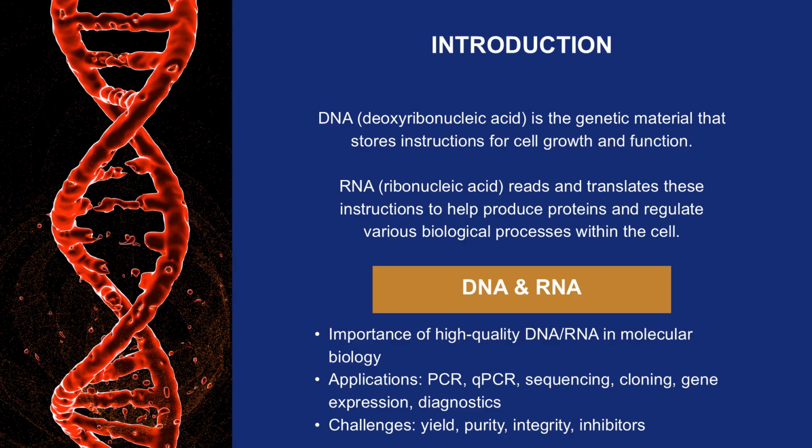RNA is a single-stranded molecule that plays a key role in gene expression and protein synthesis. It acts as a messenger carrying genetic information from DNA to the ribosome and also has structural and catalytic functions in the cell. As you know, obtaining high-quality nucleic acids is the foundation for many downstream applications such as PCR, qPCR, sequencing, and diagnostics. Let's begin with a general overview before diving into specific methods.